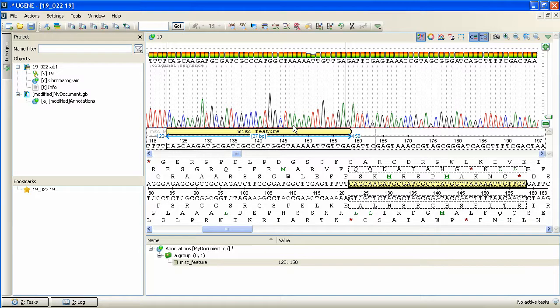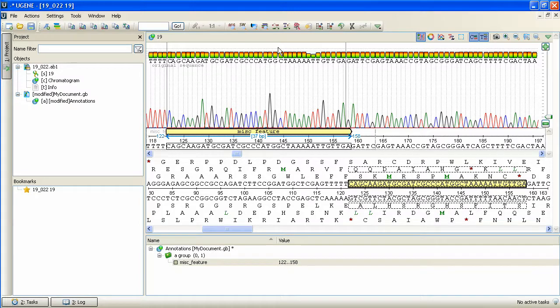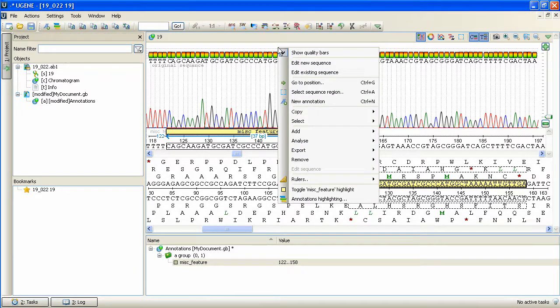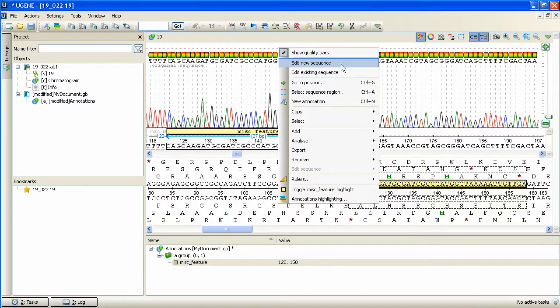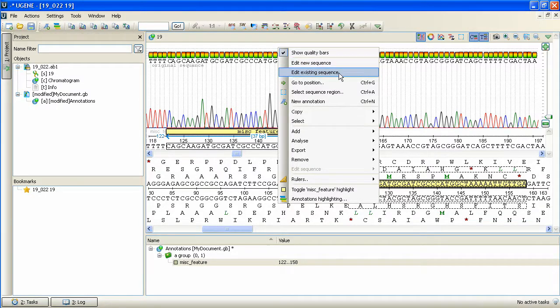It is possible in Eugene to create a copy of the current sequence and then edit it being guided by the chromatogram. To do so, we right-click at the chromatogram view to bring up the context menu, and then select Edit New Sequence. As we see, it is also possible to edit the existing sequence.